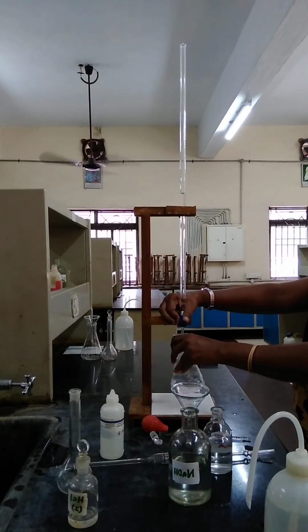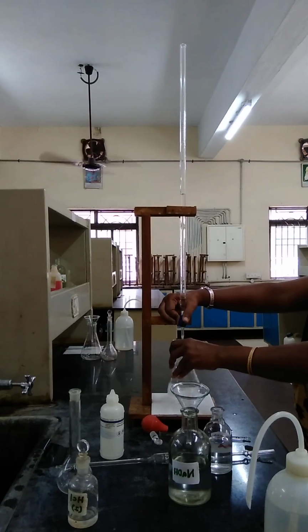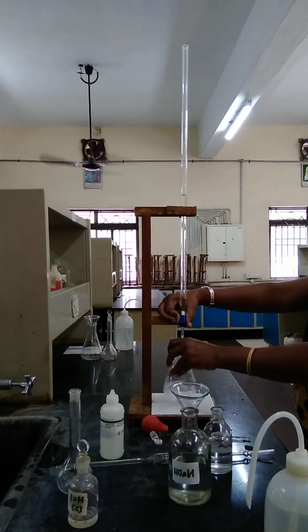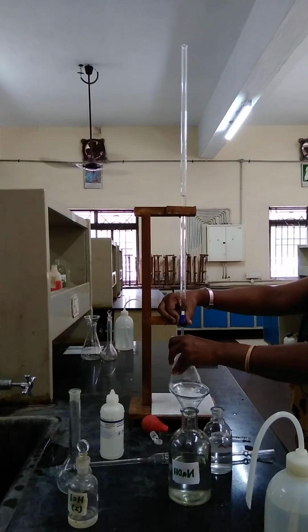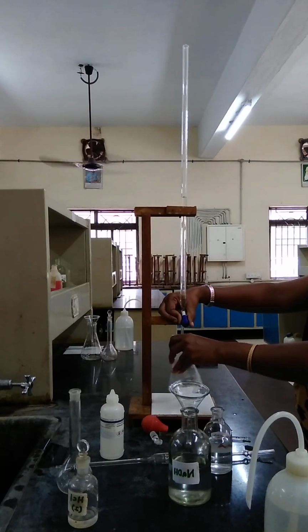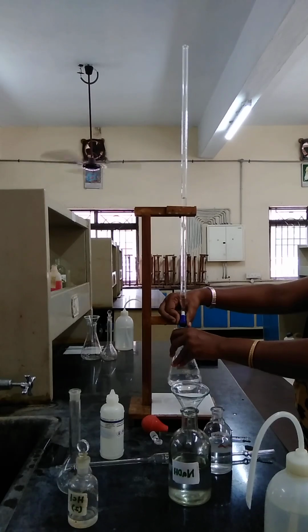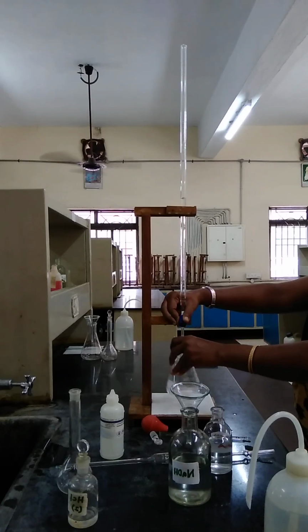We will see whether we are getting concordant readings or different readings. A person doing the experiment in school knows very clearly where students make mistakes, so they can easily eliminate the manual error. Doing the experiment so many times every day for standardization, they get the concordant value the second time itself. They go very slowly because they are reaching the end point.